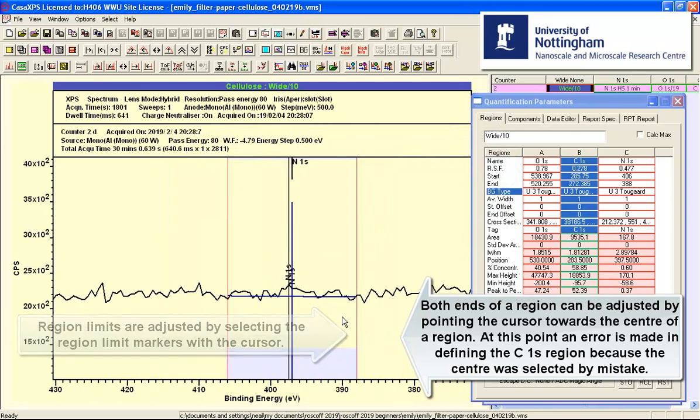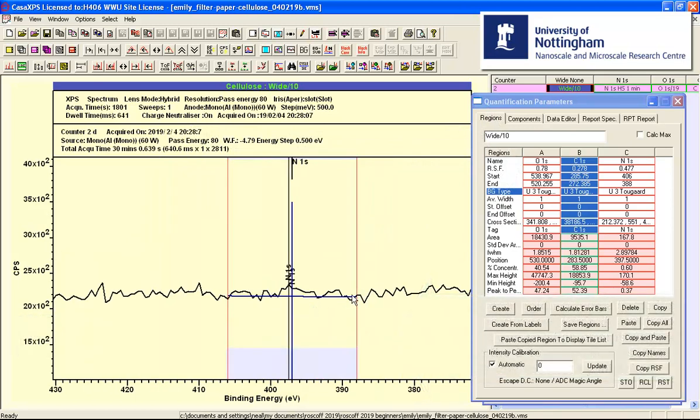Let's have a closer look at the nitrogen. So we can see that there's very little in the way of nitrogen here when we look closely. So this correlates with what the element library found or rather didn't find. Nevertheless, the next step is to go to the regions property page and we'll create a table from these regions that will include a standard deviation for the percent area.